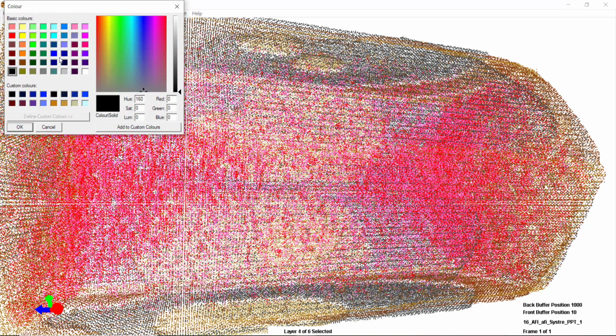And you can also add a background to your overlay, as I showed earlier in the video, so you can see it clearly when you're looking over your crystal structure. So now if I press space, you can see it's selecting all the crystal layers, and it stands out a bit clearer when you're zoomed in on your crystal structure. You can also change the color of the text overlay, so I'll change it to just some strange color. I'll change it to orange. But this information can sometimes be useful, but you probably don't want it when you're taking images, so just remember to turn it off when you don't need it.